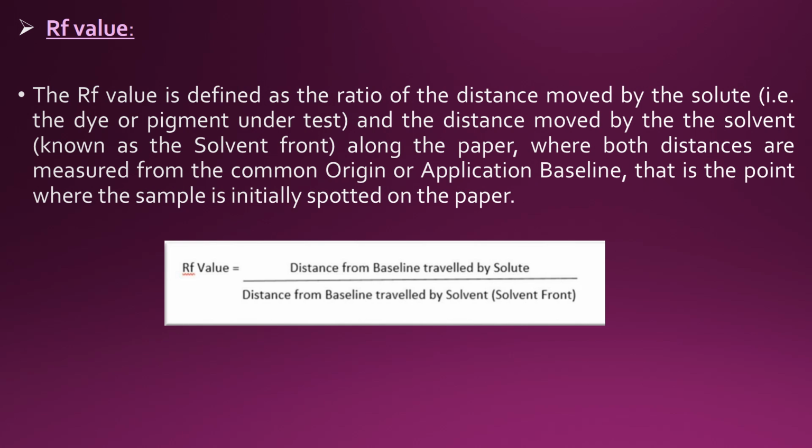The Rf value is calculated by the formula: distance from baseline travelled by solute divided by distance from baseline travelled by solvent, that is the solvent front.